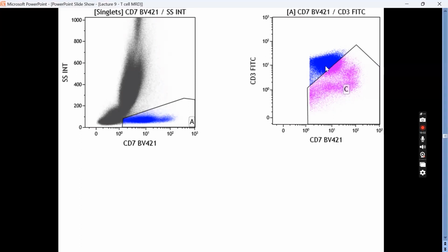Okay. So now coming to the gating marker, as I gave the simple reason, CD7 is a sensitive marker. When I say sensitive, it will pick up most of the T cells. It can pick up from the very early T cells to the mature T cells. Everything is CD7 positive. So it's a very sensitive marker for T cells. But cyto-CD3 is more specific.